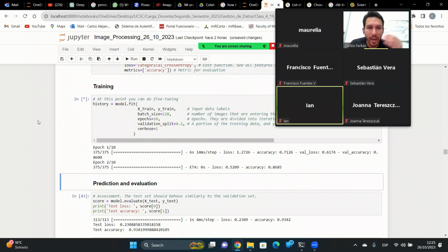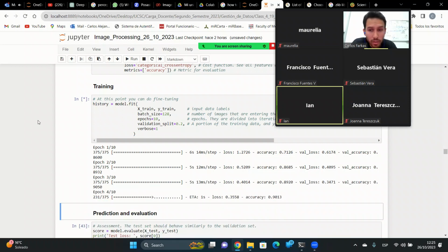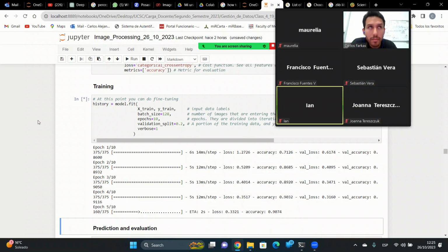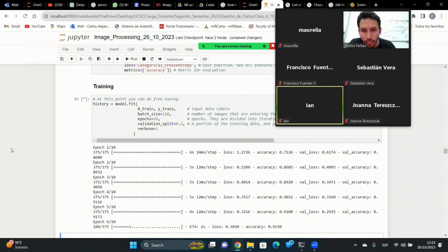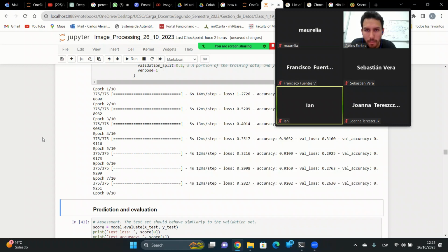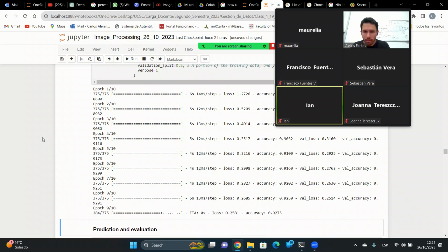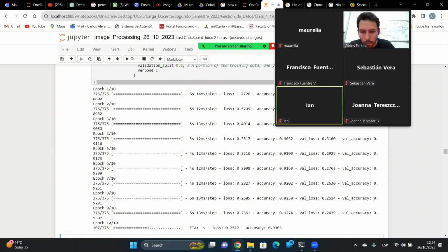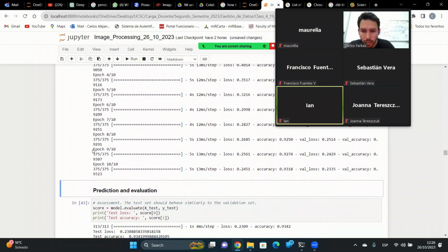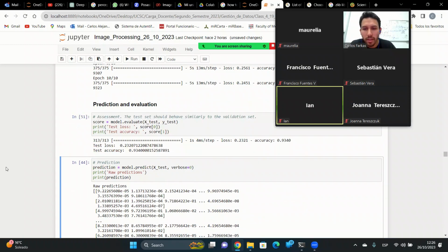As you can see here, this model is very optimized to handle a lot of data at once. So my computer doesn't have any single problem doing that. It's taking a while. And then we'll finally do the prediction and validation here, which is the loss and accuracy. So we have an accuracy, according to the small model we trained, of 0.93, which is 93.4%.